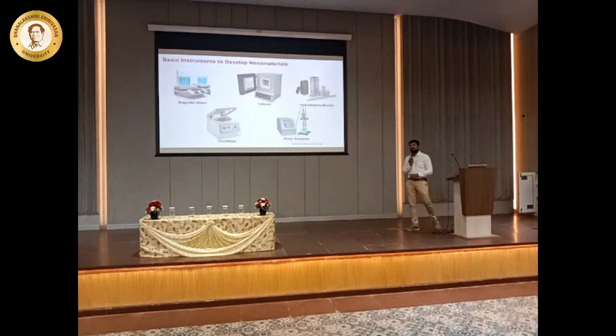So in our lab, we use a lot of these. When you go and look into a chemistry lab, you find all these instruments, right? We have this furnace because I need to give heating. I need to have a stirrer because I need to mix it. I need to have a sonicator to break it. Or I need to have a centrifuge to separate it. So what do you think if I start incorporating all these devices into one small chip? Do you think it is really possible?